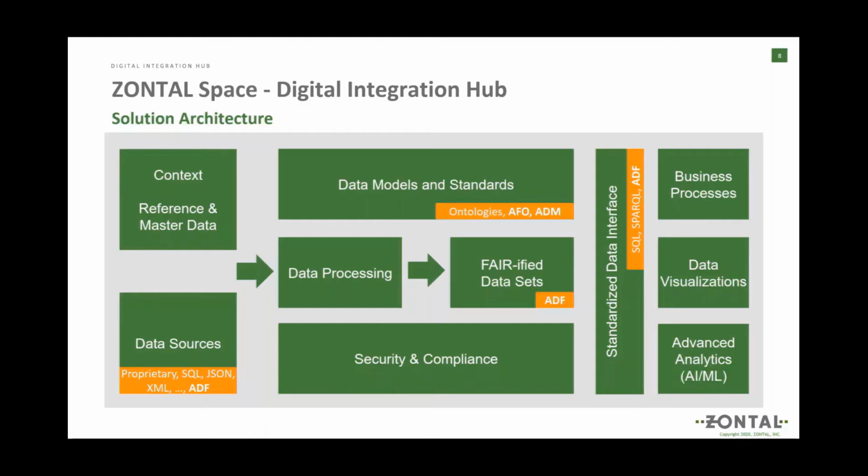And then, of course, also internally on our side, we had teams from OSTUS helping with implementing the data strategy, creating all the ontologies and data models. We worked with the Accurate team, and we will have a presentation later today about what this tool can provide. And finally, of course, the ZONTAL team to put this all together. So what we see here on this picture is more than the technical view. On the left side, we have various data sources, and these can be in proprietary format, SQL databases, JSON or XML files, or of course, increasingly also ADF files that are provided, for example, by the instrument vendors.